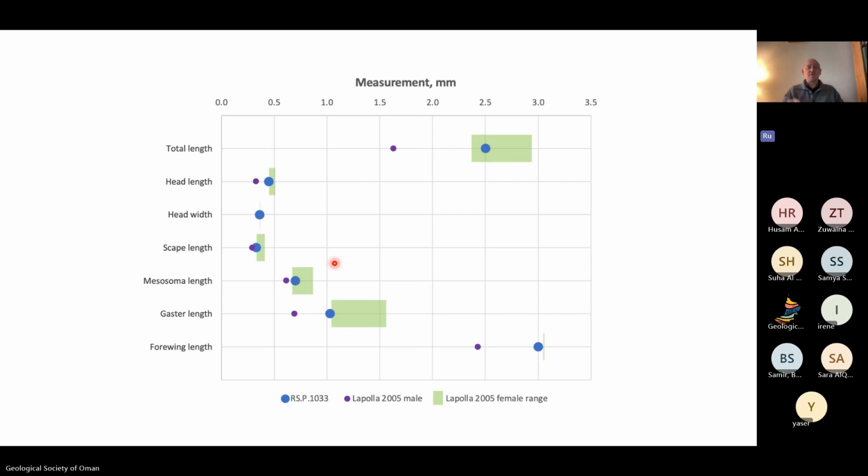But I have in the big blue circles there got the most precise measurements, because I can just click at one end of the thing I want, click at the other end, and I've got the measurement. Whereas the other ones are all taken from photographs, and incredibly often with 3 decimal places, and you think, well, hey, you don't even know that you're looking in the right angle. But that's a benefit of these 3D images, of course. Next slide, please.